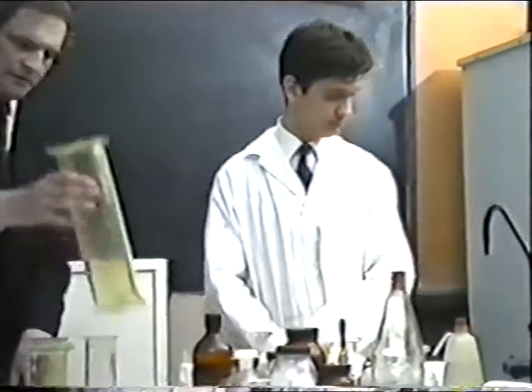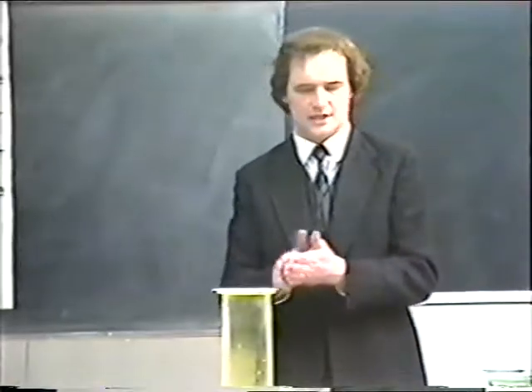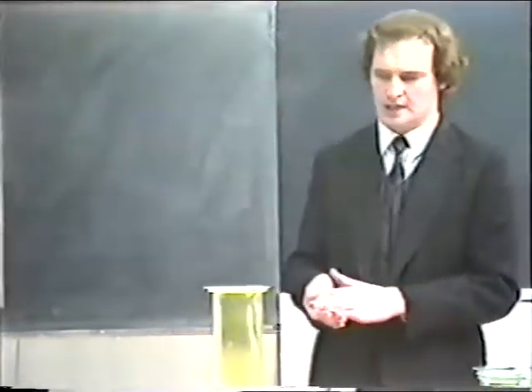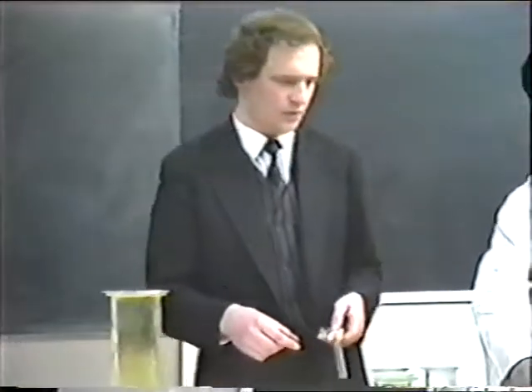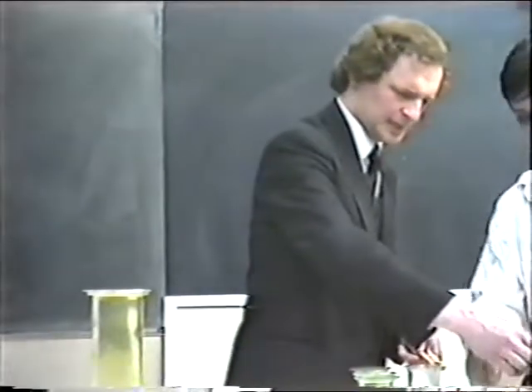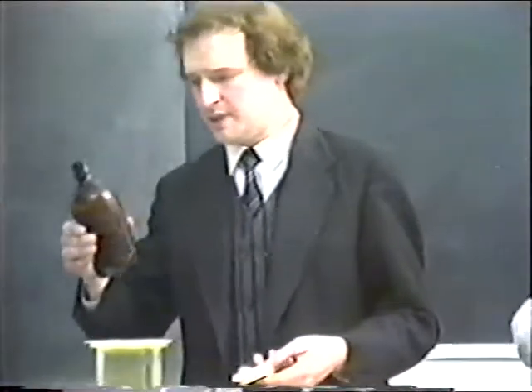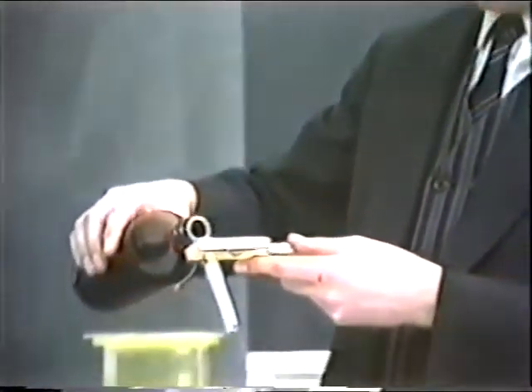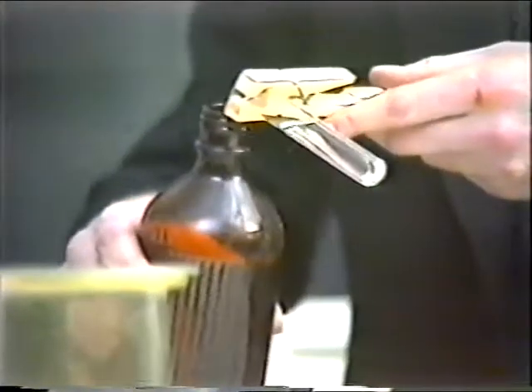Now, for the final demonstration in this series, the final demonstration in the series with gas jars, should I say, I'm going to demonstrate the reaction between hot turpentine and chlorine. Now, turpentine has a very pleasant smell, but you shouldn't smell it because it's very bad for you. It's also extremely inflammable. And I'm going to heat up a small quantity of turpentine. Actually, that's rather a large quantity I've got in there. Let's just pour some back in. There we are.